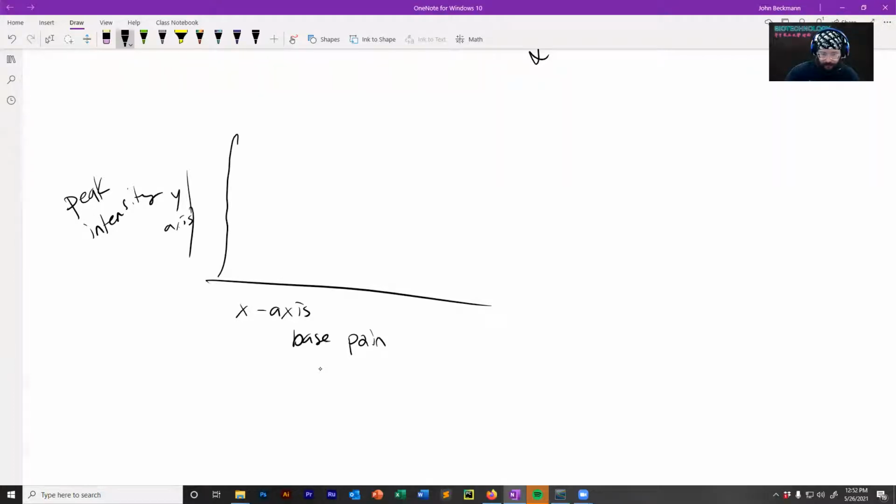The height of the peak is a good readout of like quality. Okay, so if you see stuff like this, that's typically going to be bad Sanger data. Sometimes it's still interpretable. Like you will get a text file from data that looks like this, and they will assemble some text sequence. And sometimes that text is relevant and it's good, actually can be good data. But it's bad in a sense that there's a lot of error rate when the peak intensity is very low.